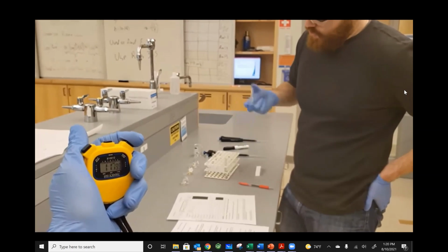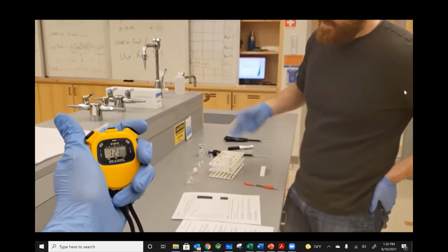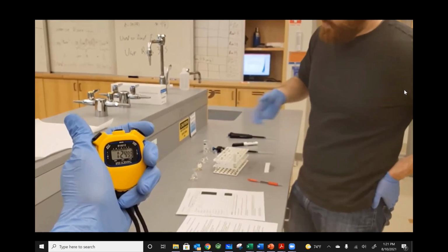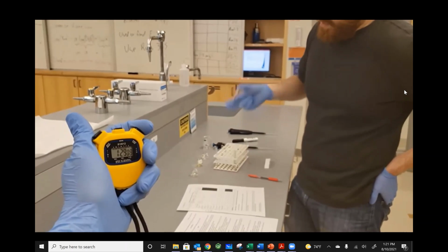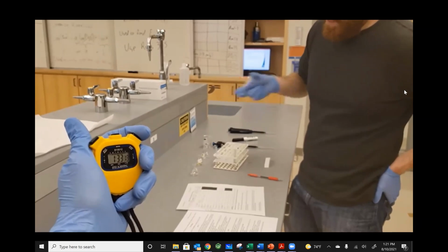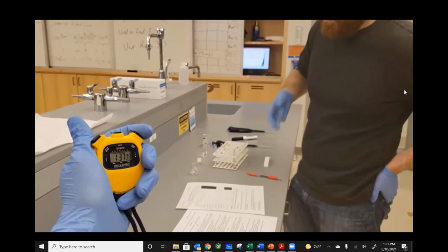So all of our changes in hydrogen peroxide should be the same as the amount of thiosulfate consumed, because all we're doing is monitoring the change in the hydrogen peroxide in a certain amount of time. So line 5 should in theory be the same across.